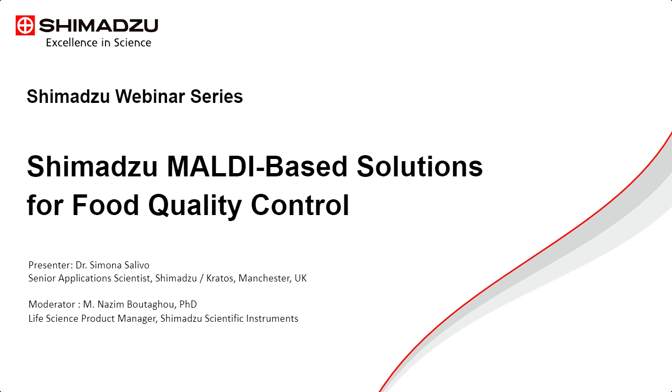Today's webinar focuses on MALDI-based solutions for food quality control. In this webinar, we will be discussing how MALDI-TOF instruments can be used to analyze various food matrices and help detect and hence deter adulteration. Food matrices encompass olive oil, honey, milk, and meat. Again, we ask that you submit your questions through the widget, and we will do our best to answer them at the end of the webinar during the Q&A session.